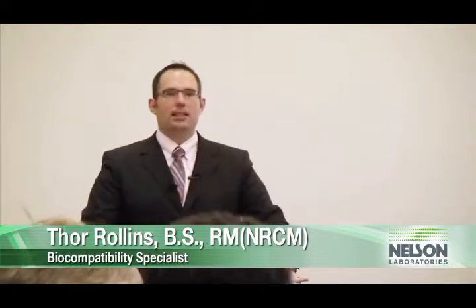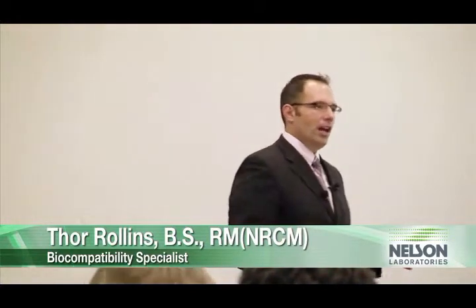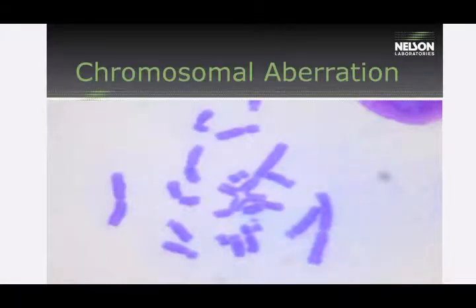Then we stop the cells. We don't let them grow anymore. We freeze them, and then we kind of smush them apart. Okay? And what we're looking for is something called a karyotype. And this is a karyotype. What it is, it's the chromosomes. So these purple spaghetti-looking things are the chromosomes inside these Chinese hamster ovary cells.